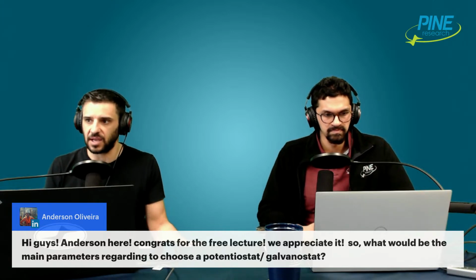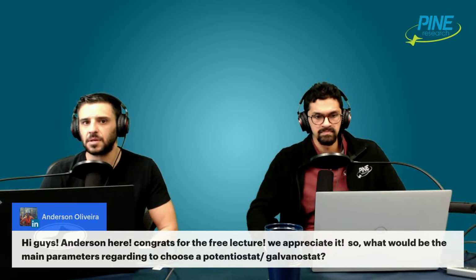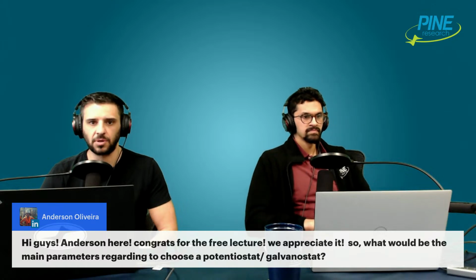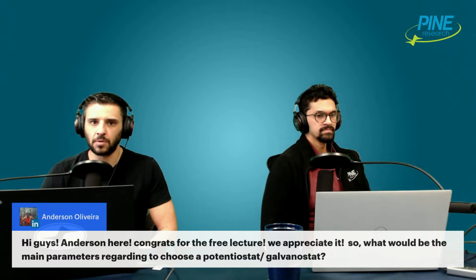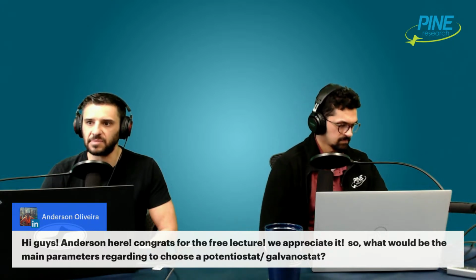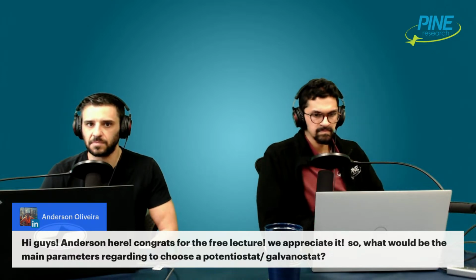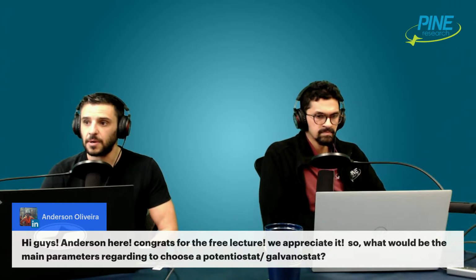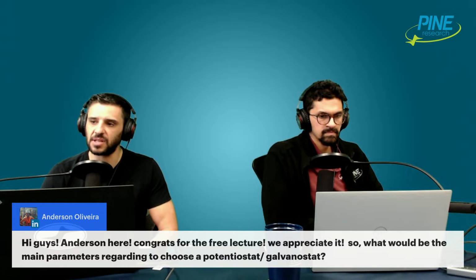So if you're doing things like small scale, solution phase electrochemistry on small electrodes, disc electrodes, things of that nature, the currents you're looking at are probably in the milliamp to microamp range, right? So if you have a potentiostat that gives you a few hundred milliamps to an amp or something, that's probably more than sufficient. Hundreds of milliamps is probably enough as well. Some smaller form potentiostats, for instance.